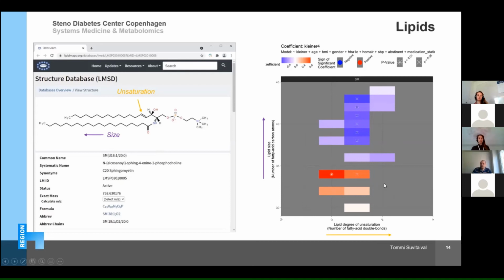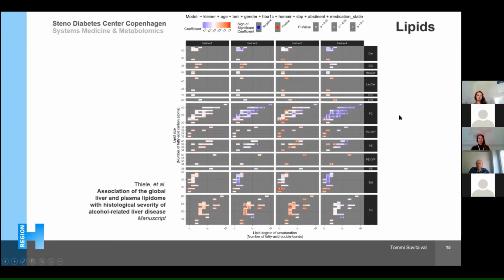This result is from Galaxy, actually, and by doing this more systematically, we can look at many lipid classes like sphingomyelins, as I showed, and phosphatidylcholines at different stages of disease. So going from more healthy liver onwards to fibrotic liver. And this data we have integrated with other omics, gene expression, gene regulation, and also lately a Mendelian randomization study to validate some of these findings.